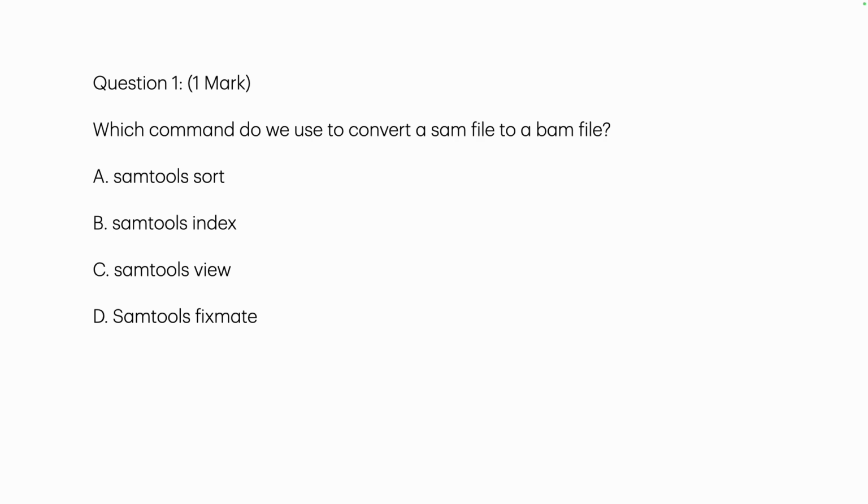One of the answers is correct, Karthik. We have another option, C, samtools view.